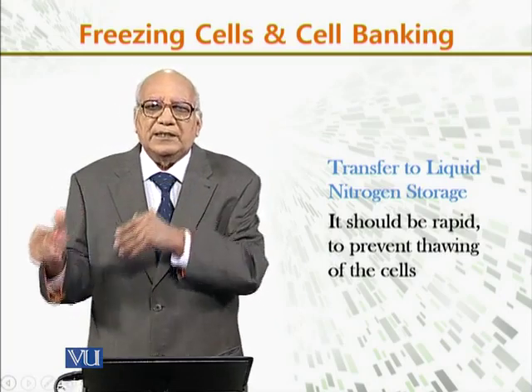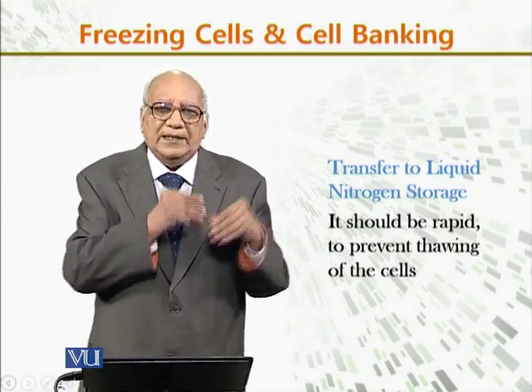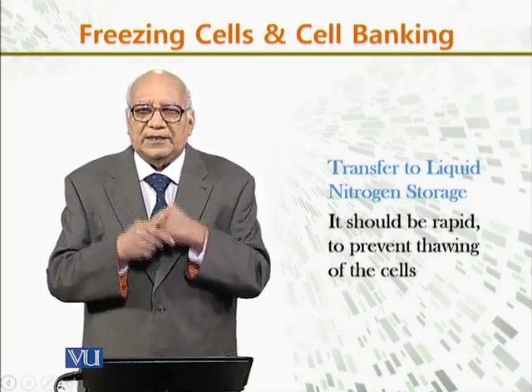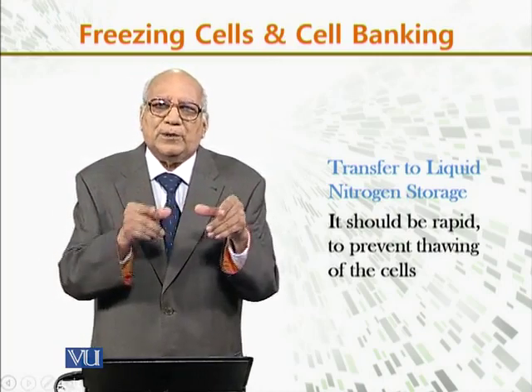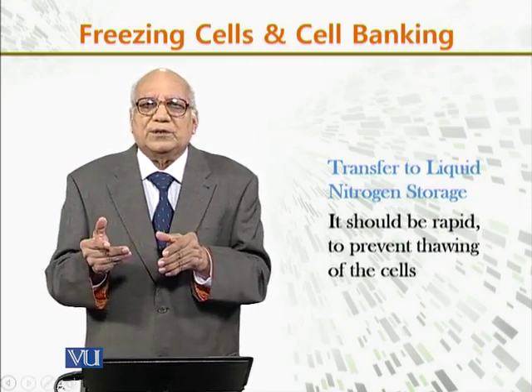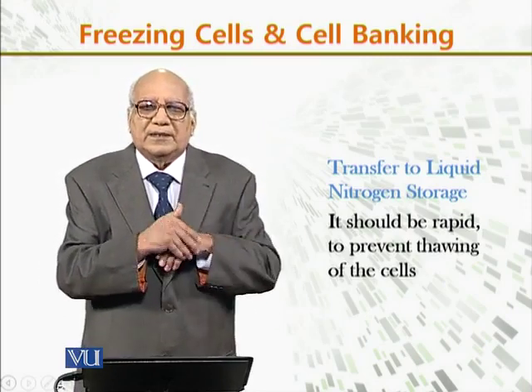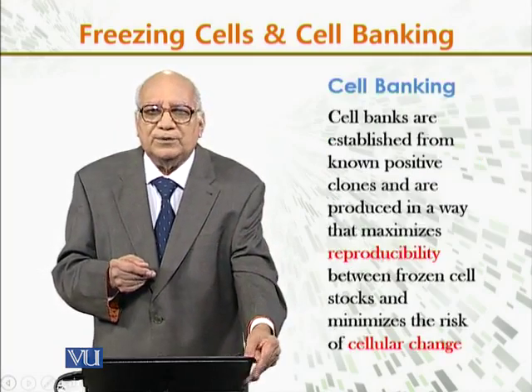That is, we take the cells from that container, and then we put them into the nitrogen storage cryogenic cylinder, which contains liquid nitrogen. And this process should be very quick. It is not that we took those cells in the morning and then in the afternoon put them in the liquid nitrogen. No, because they will thaw.